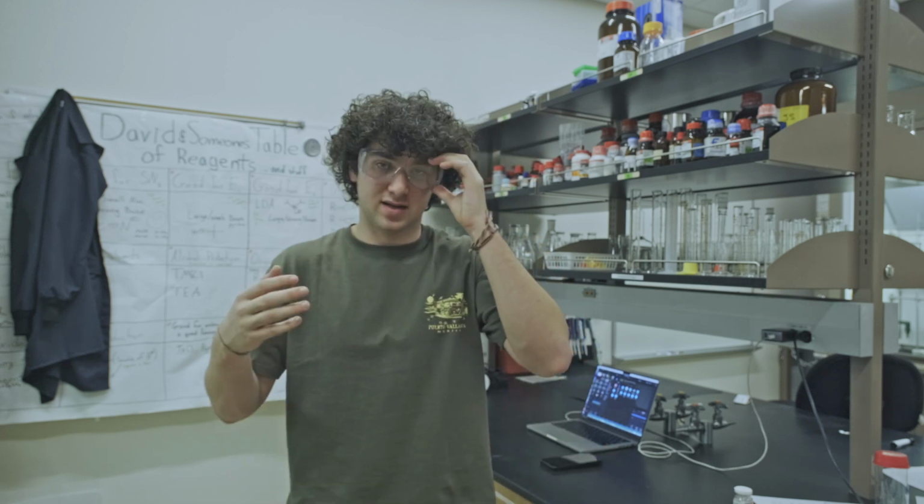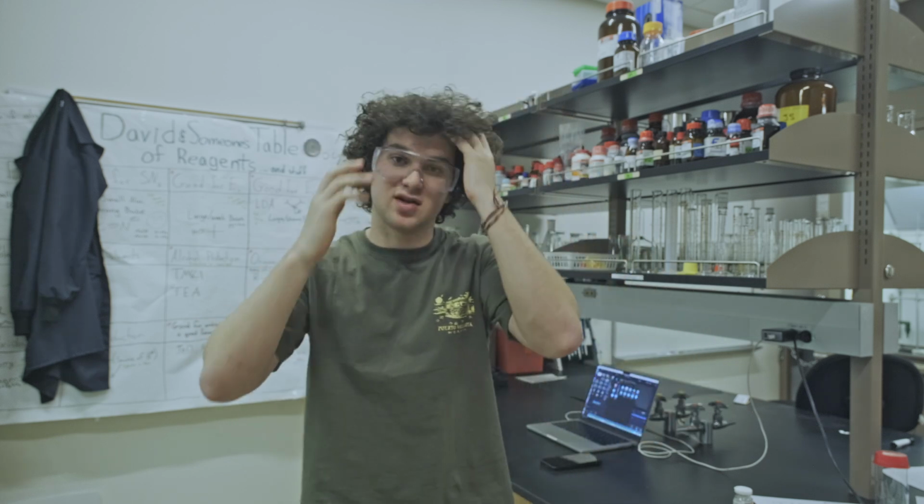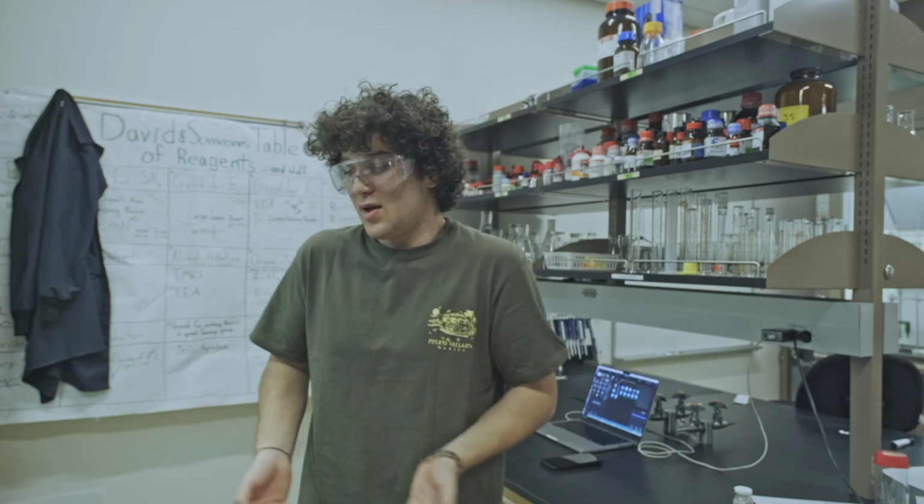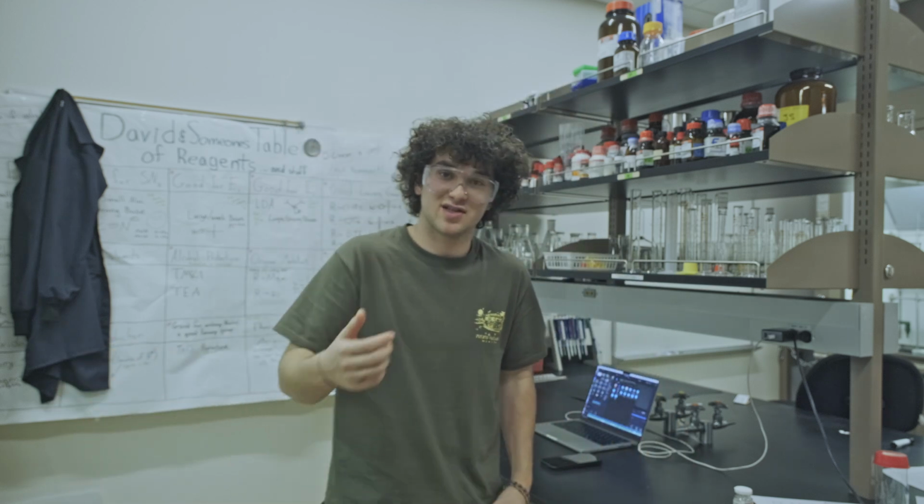So, as you can see, the synthesis of aspirin is pretty simple, but yet it still took me 3 tries. 1, probably because I'm not a great chemist yet, and 2, just because chemistry can be a pain sometimes, and when things should work in theory, sometimes they don't work in practice, or maybe there's just something random that you're doing wrong. But anyway, whenever you're doing chemistry stuff, it's just important to keep on trying, because eventually if you keep trying, you will succeed.